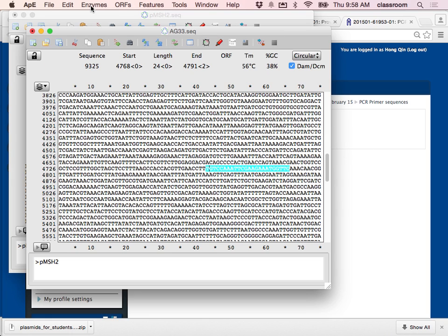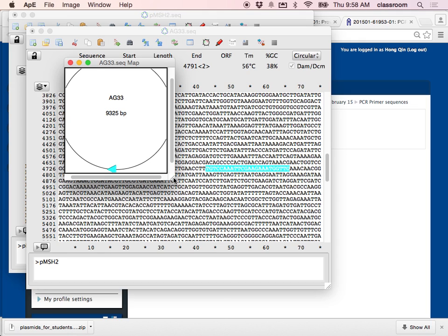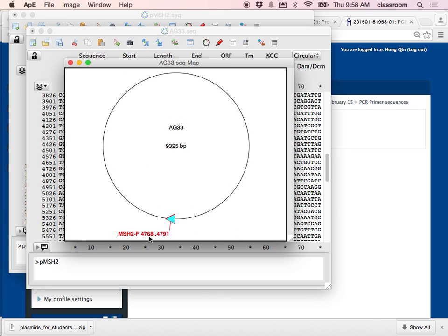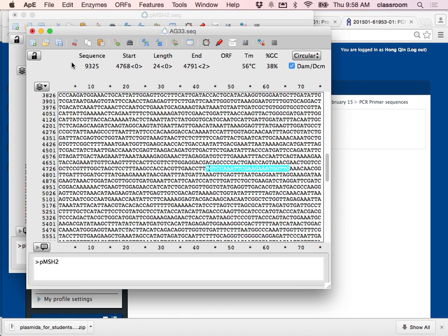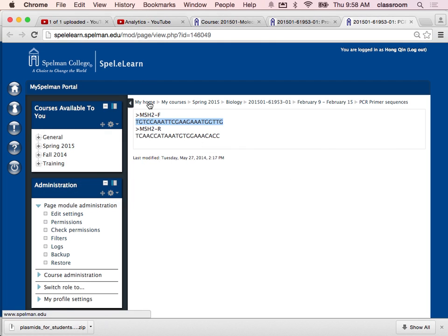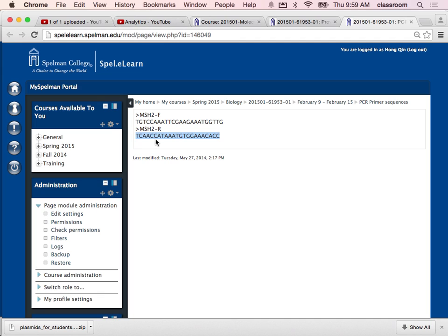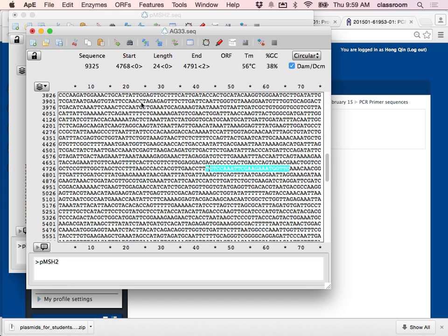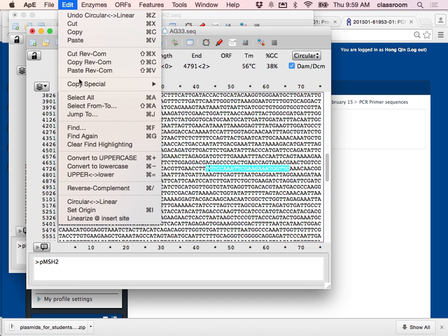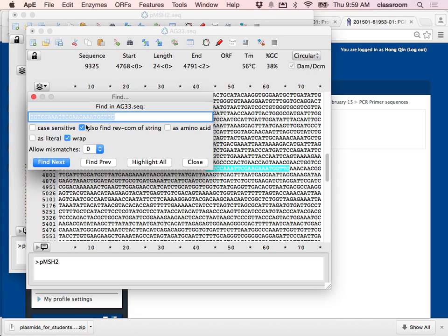If you want to see what that looks like, go back to the graph — you can see the very large arrow, that's the forward primer. Now I'm going to find the reverse primer on the reverse complemented strand. I go back to Moodle, select the reverse primer sequence, go to Edit, Copy, then go back to APE, Edit, Find, and paste it — TCAACCA.